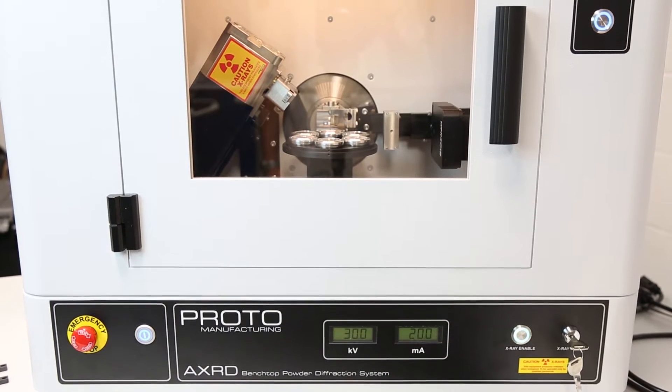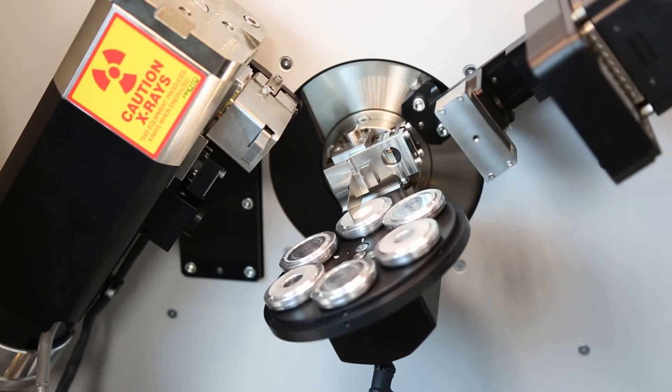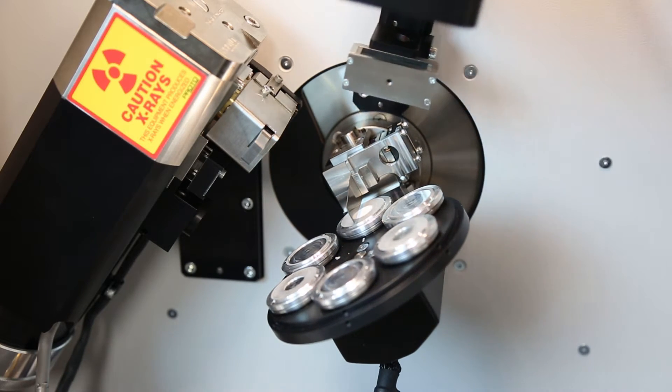The AXRD is ideal for phase identification and quantitative analysis of a variety of sample types. Organics such as pharmaceuticals and inorganics such as cements and minerals, even clays, can be analyzed with the AXRD. Our team is uniquely diverse — that is why we've been able to develop a system that is highly adaptable to so many different industries.